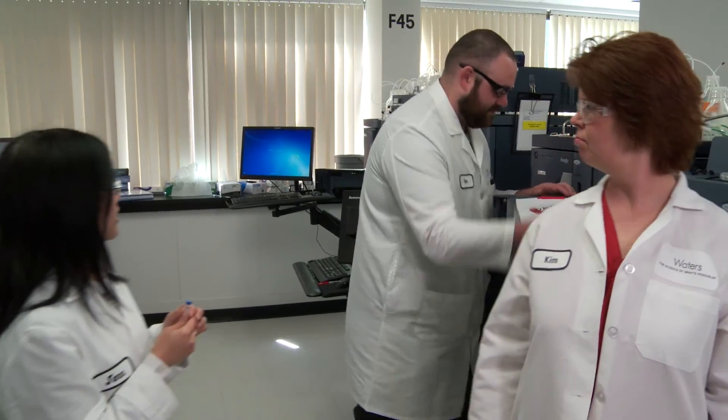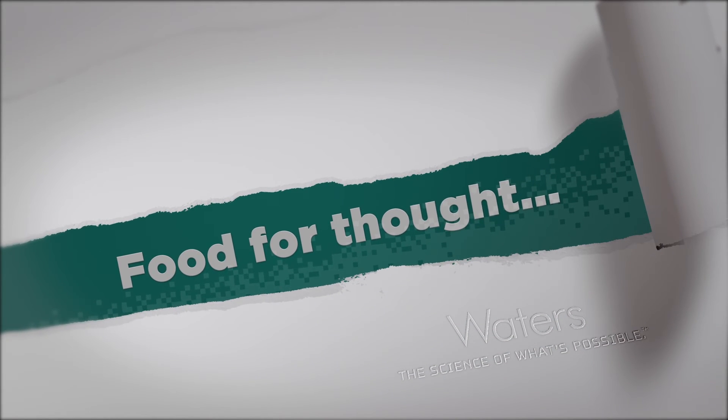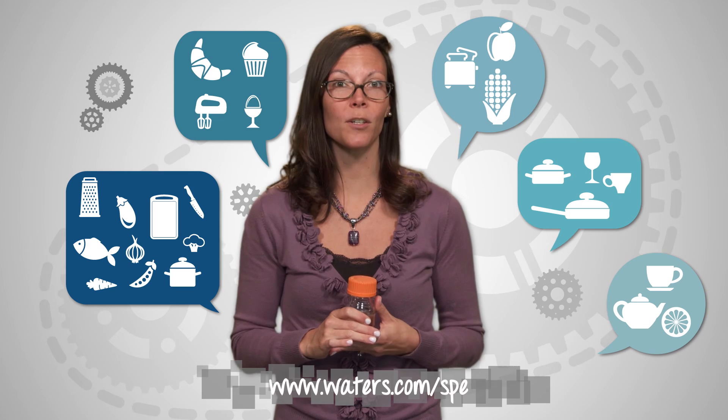Let me get started on this so I can finish my work and get back on the MS. Wow, so much cleaner. I knew I had a problem and needed some sort of cleanup solution for my samples, but honestly avoided SPE for the longest time because I thought it would be way too complicated to develop and optimize a method. Looking at Oasis Prime HLB, I now have a simple starting point that's not intimidating. The added bonus is that instrument downtime will be less and I will be getting more out of my columns. Plus, my MS colleagues will let me back near their instruments — win-win. Check out the links below to learn more about SPE, featuring how-to videos as well as a great method development reference. And join us next time for another episode of Behind the Science.